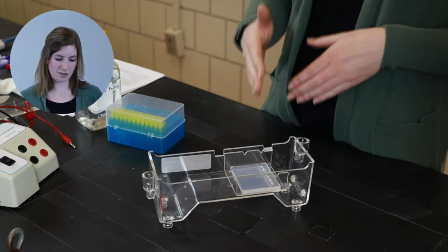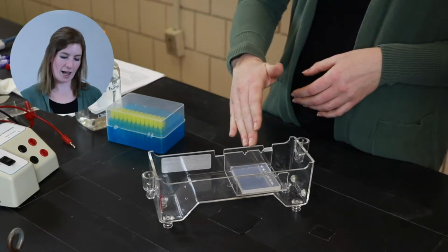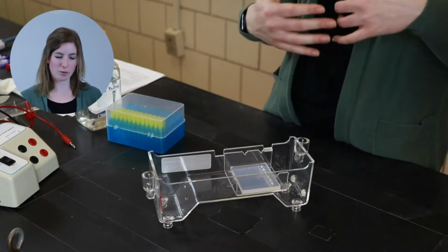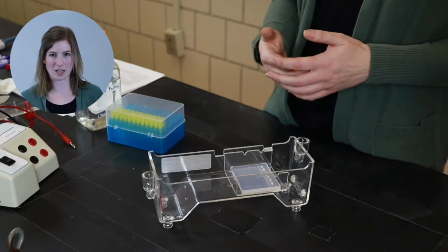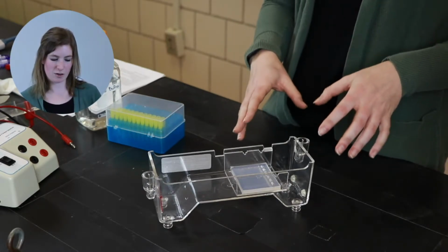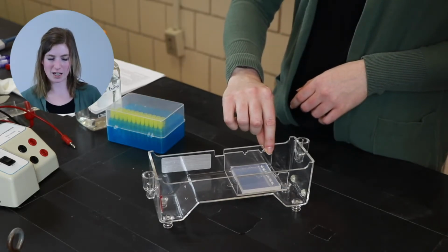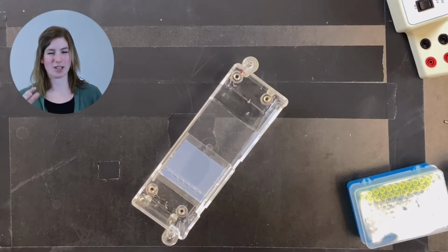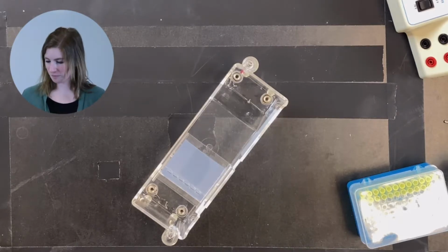And this is good because this means my samples will run the correct direction, where I have a lot of space for my samples to move. If it ran backwards, my samples would pretty much run right off the gel almost immediately. So it's really important that you get it set up correctly. This is a little bit foolproof because it has the notch in it, but it's definitely possible to mess it up and your sample would run backwards and you would end up with nothing on your gel.